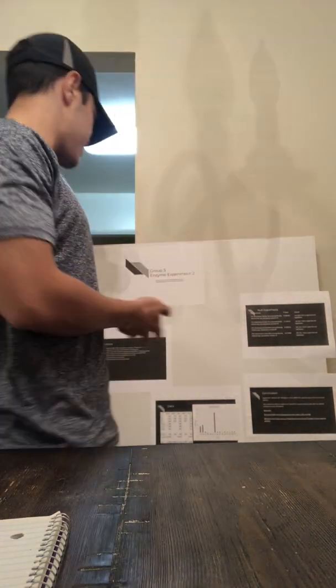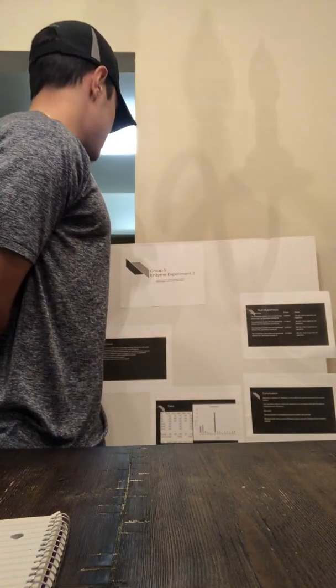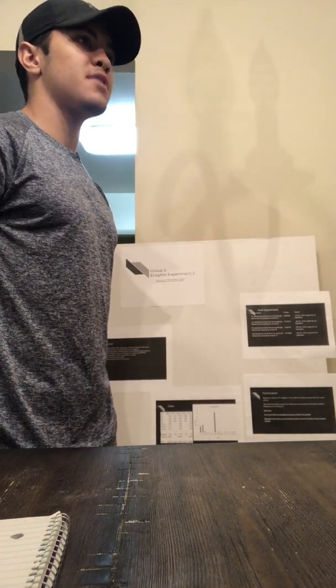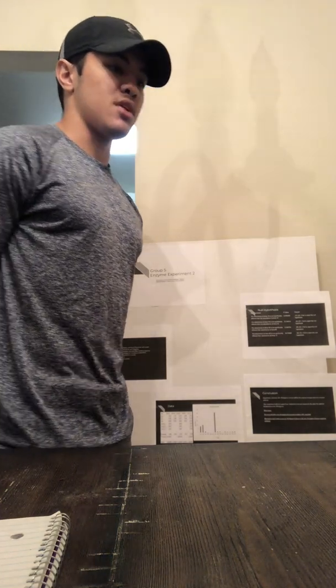Hello, I am Marc Landicho, and this is my presentation on enzyme experiment number 2. In this experiment, we tested how temperature affects the reaction of enzymes.